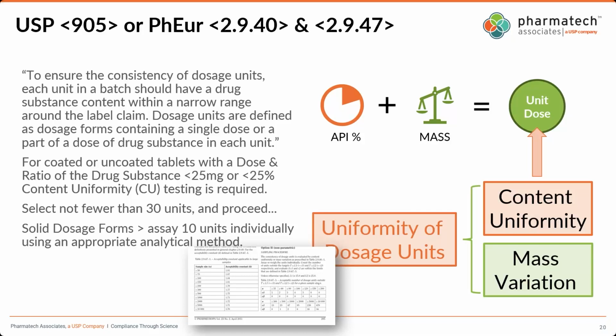I think that's where I see some modification could be done. But I would mention, with my personal interactions with our stakeholders, those who are doing continuous manufacturing, even end-to-end for oral solid dosages, they are comfortable using the existing USP 905 to do the batch release. So I think there's that discontinuity between real-time release and content uniformity testing. That's a big topic, and bridging that would require a lot of effort and consensus between different stakeholders.